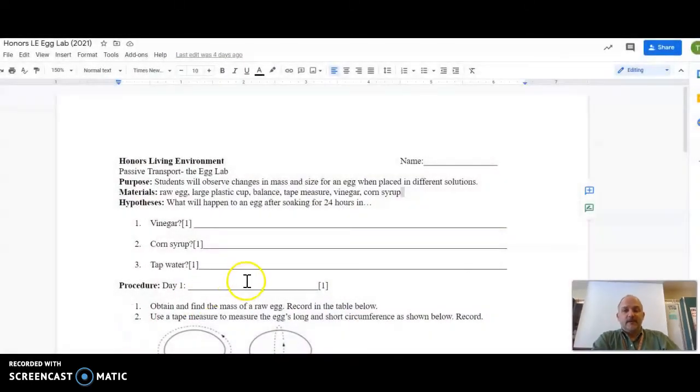Greetings. This video is to set you up and get you started with the egg lab, in which we take an egg and we subject it to some changes. Okay? The egg lab looks like this.